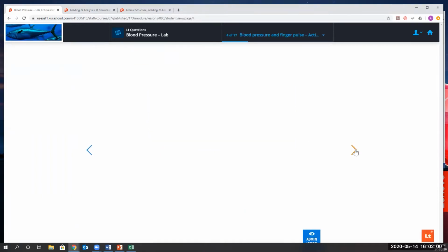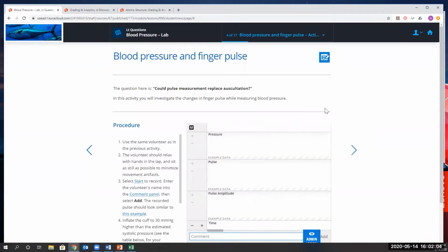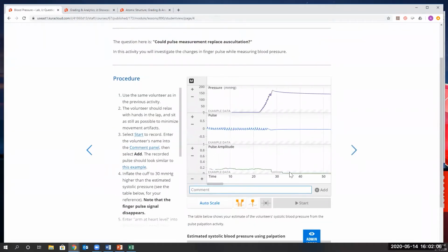So the students will be setting everything up in order to do the actual recording. As soon as they get to the exercise or activity page, this data panel will show up here. They'll be able to hit that start button, and then they will be doing live recording, and the data will be recorded live. So this absolutely is possible when they're inside of the lab. Doing labs remotely, that's not necessarily able to do live recording, but we do have example data for remote use.